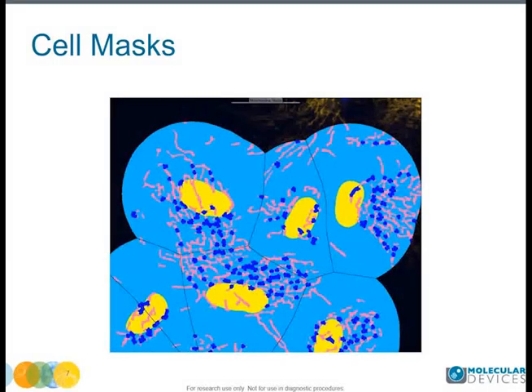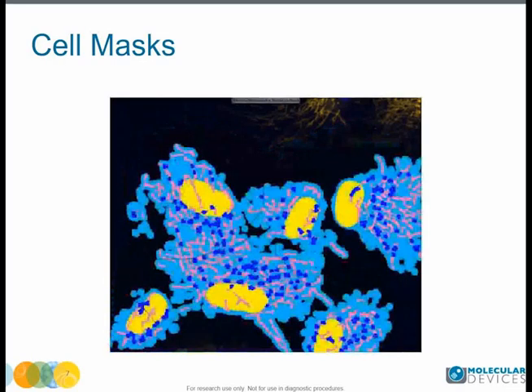Or we could create a more complete mask that segments all of the important pixels, both nuclei and mitochondria, together to generate a cell mask, which would look like this. For our module, since we are using numbers generated by specific masks for the nuclei and the mitochondria, we could use the first approach without much of an issue. And we would prefer doing it this way, since it is much quicker, and this module is long enough as it is.